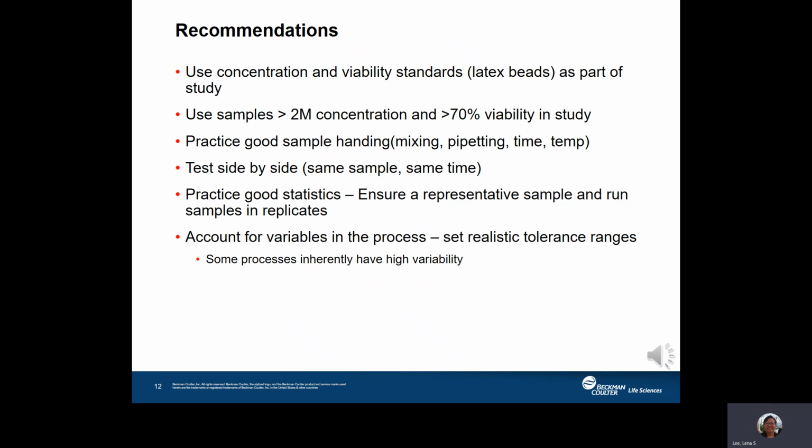And you should be able to determine this based on your counting performance that you would have done before you started your correlation studies with the two methods. And then definitely account for differences in technology. In our example, the Vicell XR is an instrument that was out on the market close to 20 years ago versus the Vicell BLU, which has very recent technology. So you will have some differences in the technology that can add to the differences within the two methods.